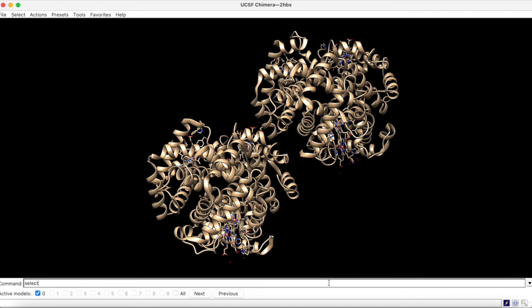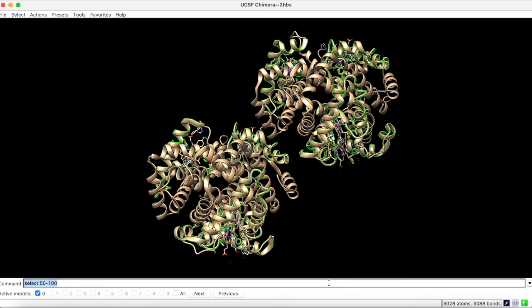you would type into the command line: select, colon, and the desired residue position range. Upon hitting enter, these positions are highlighted in green.